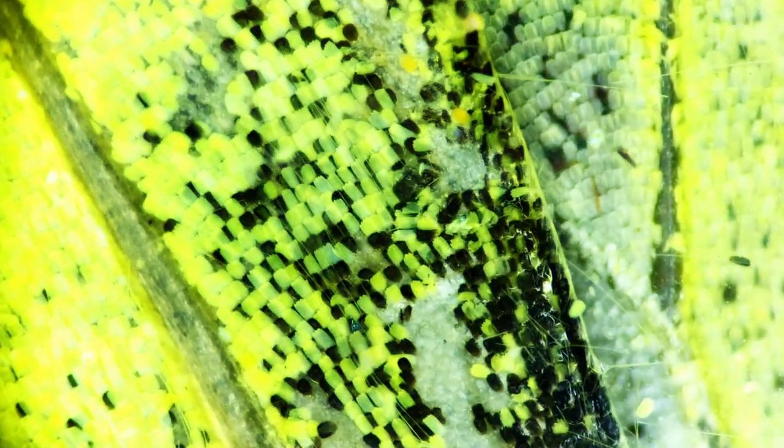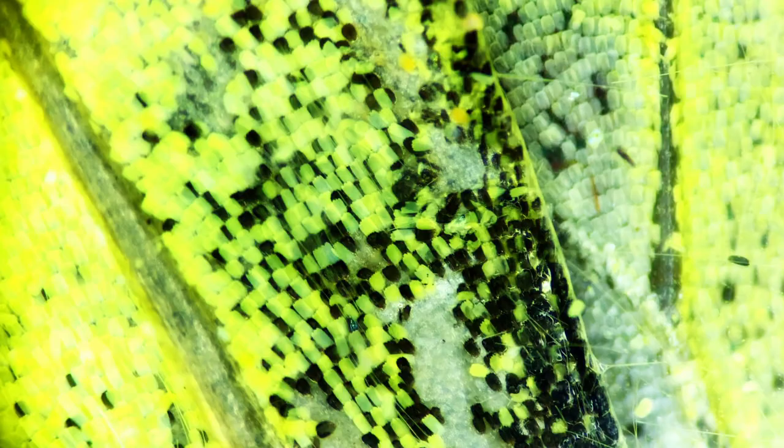This here is now the view through my stereo microscope and we're looking now here at a butterfly wing. You can look at the individual scales. The zoom was an optical zoom not a digital zoom and as you can see it looks quite nice here. This is my finger, some skin under the microscope as well.